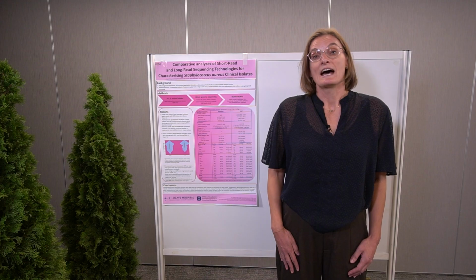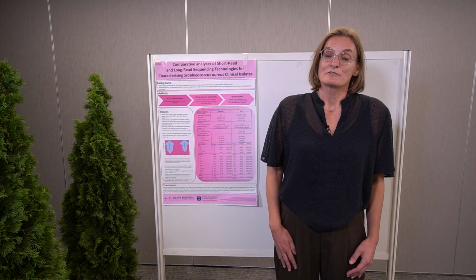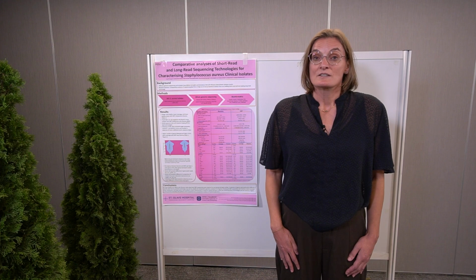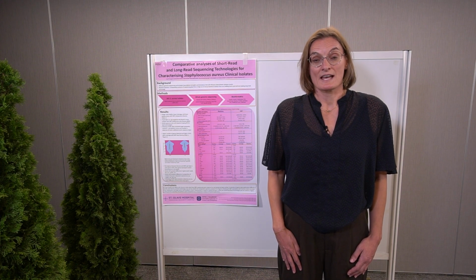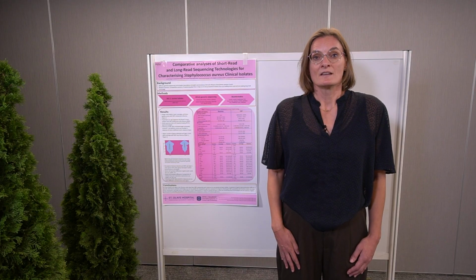First of all, the quality measures and typing results were quite as expected. The short read had higher per base quality and had higher coverage, and the long read had much longer contigs and higher N50. And after polishing, we saw that the long reads had about, on average, 20 base errors and a bit more than 20 indel errors per assembly.